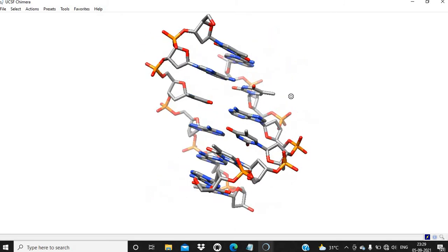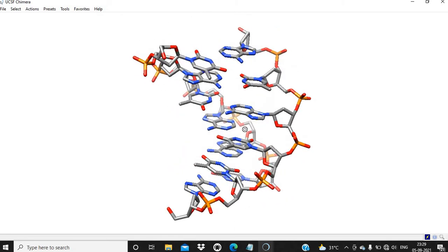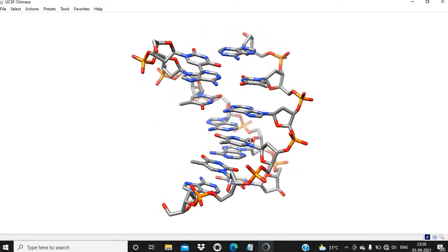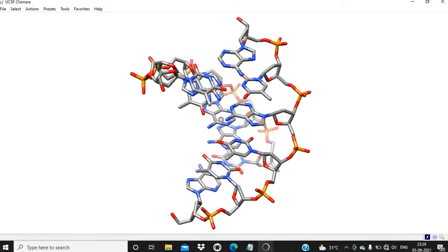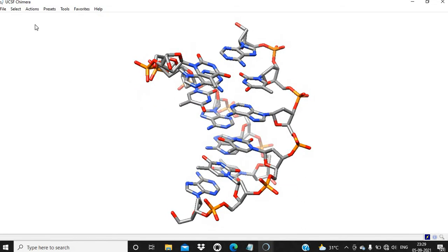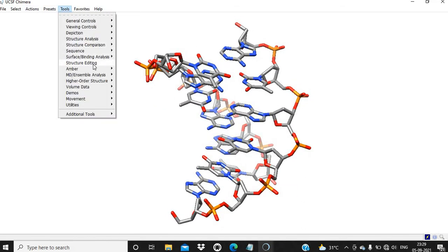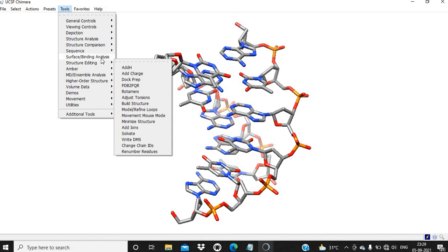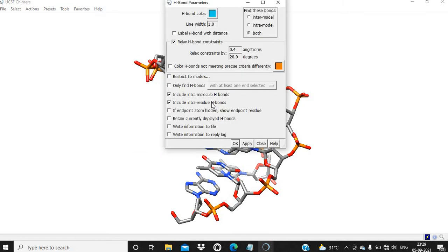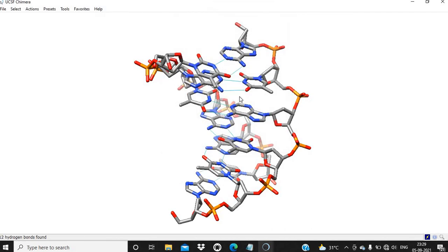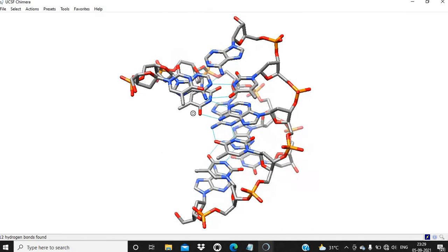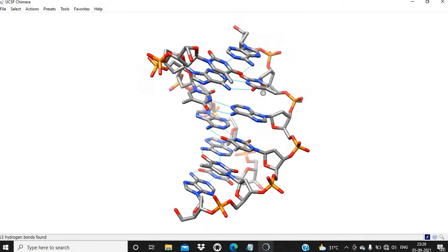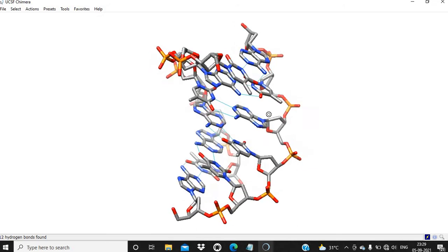Now all these atoms are visible and we can also see the hydrogen bonds here. Surface Binding Analysis, Find H Bonds. Now you can see all H bonds.